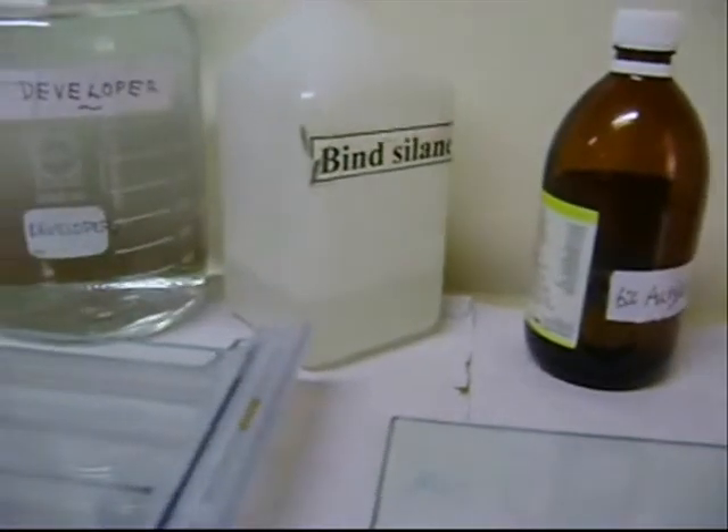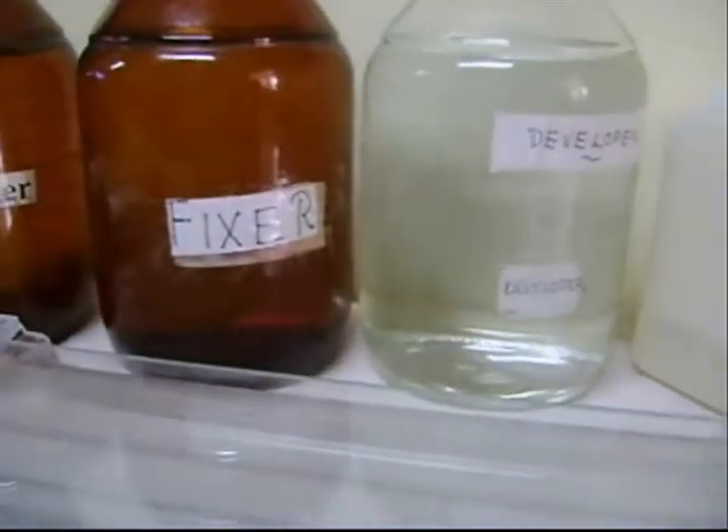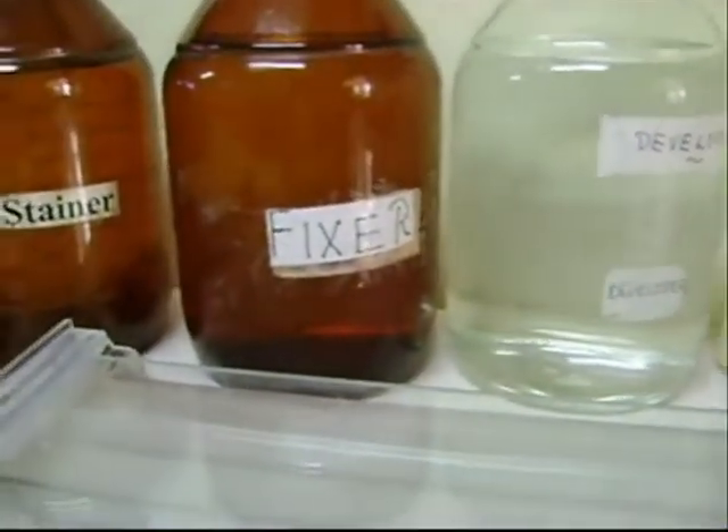The next step is urea PAGE. The reagents required are acrylamide, APS, TEMED, bind-silane, repel-silane, developer, fixer, and stainer.